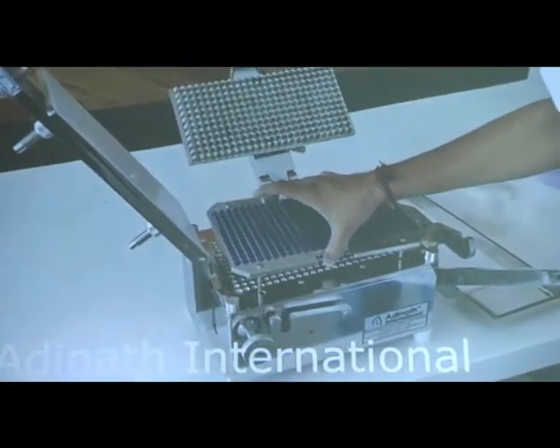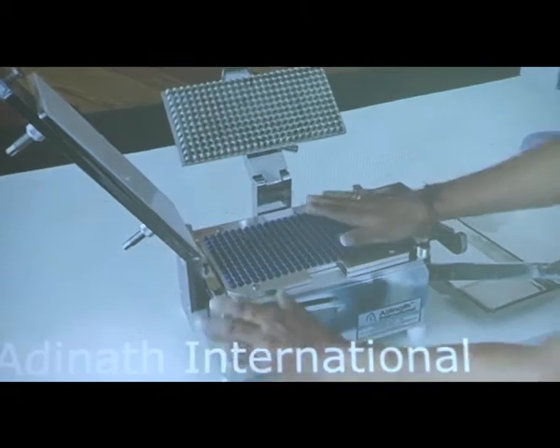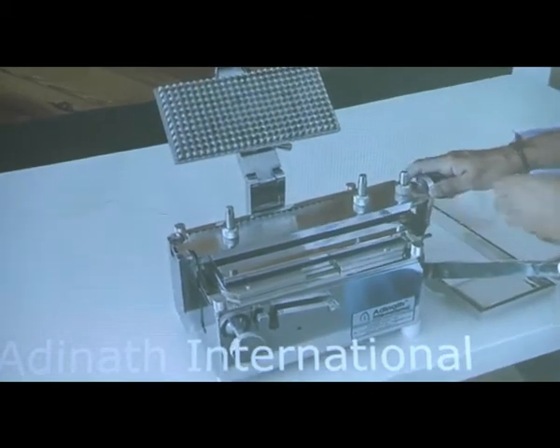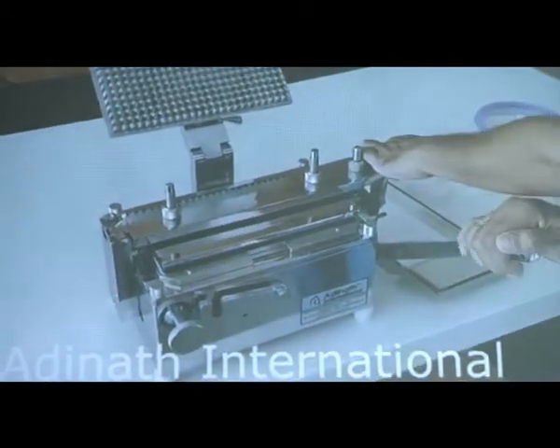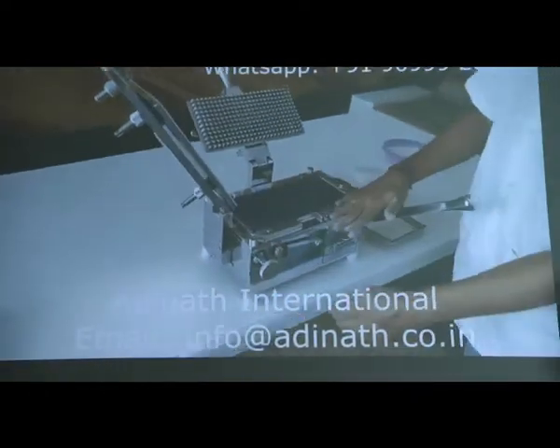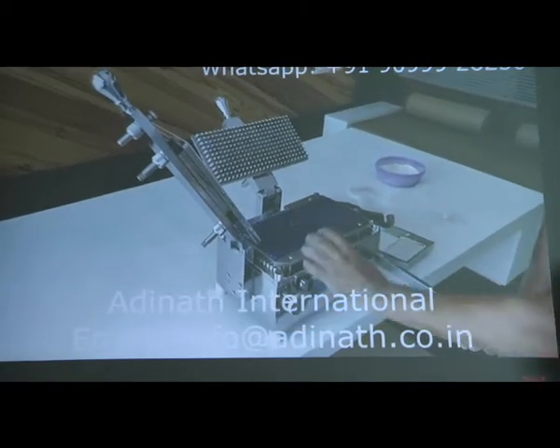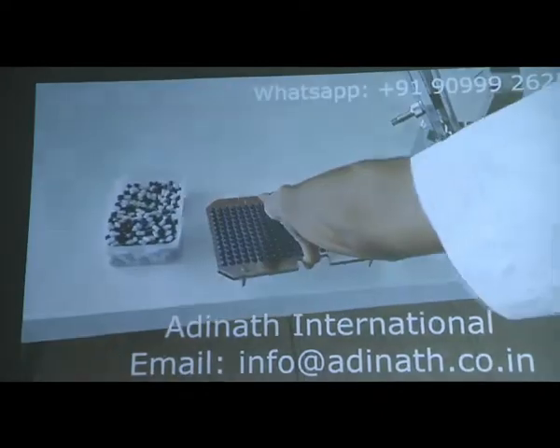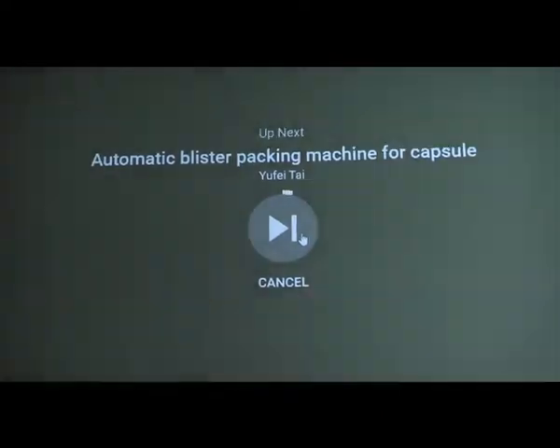Now we take the caps of the capsules. We need to lock the caps onto the bodies by using another plate, and we are going to lock this plate. Now again we pull the ejection lever, by which the caps and bodies of our capsules will get locked. And now we can simply remove the plate, and we will get the finally filled capsules. These are the finally filled and sealed capsules you get by using the hand operated capsule filling machine.